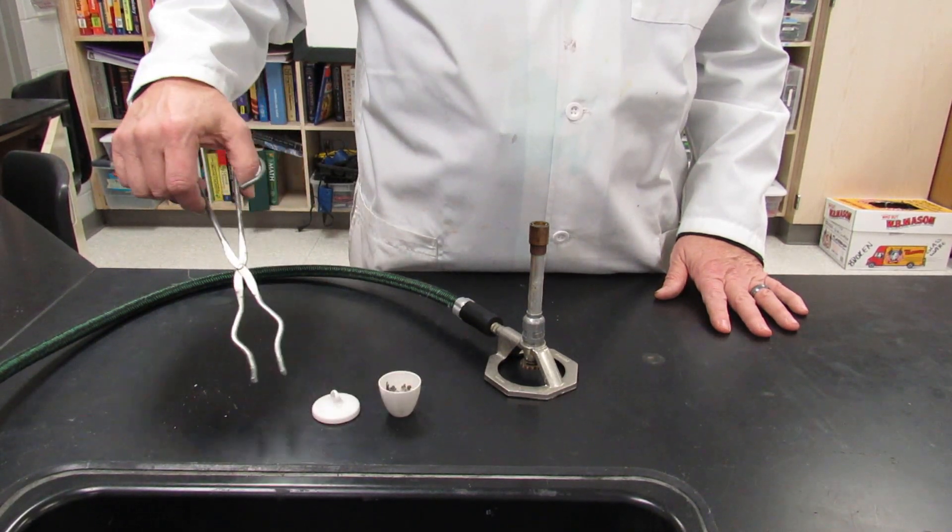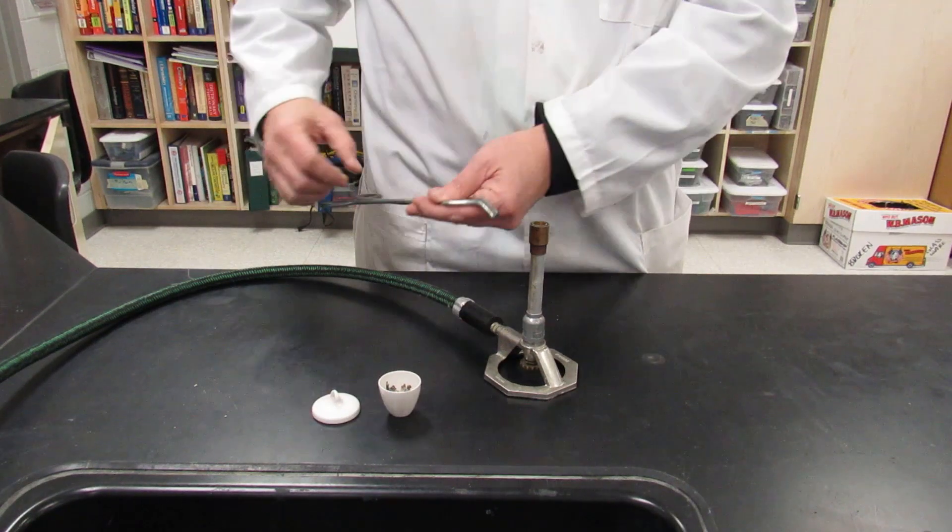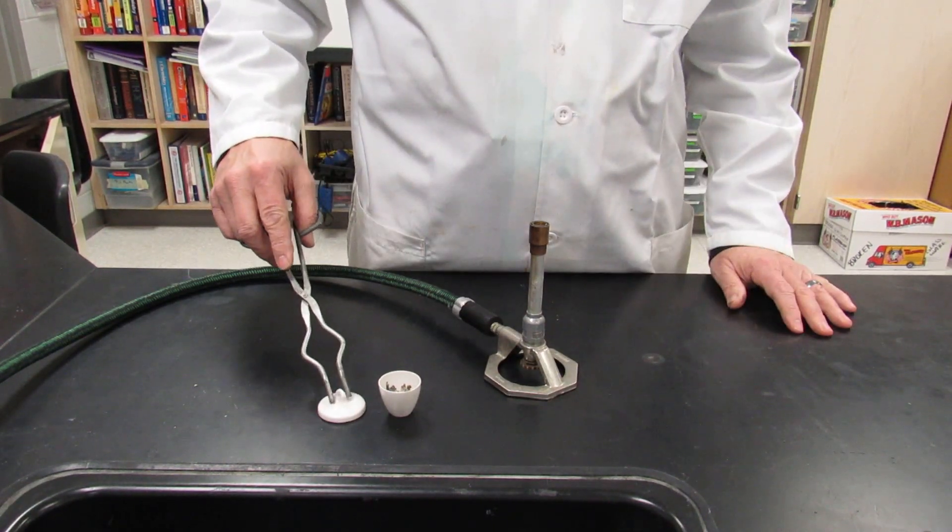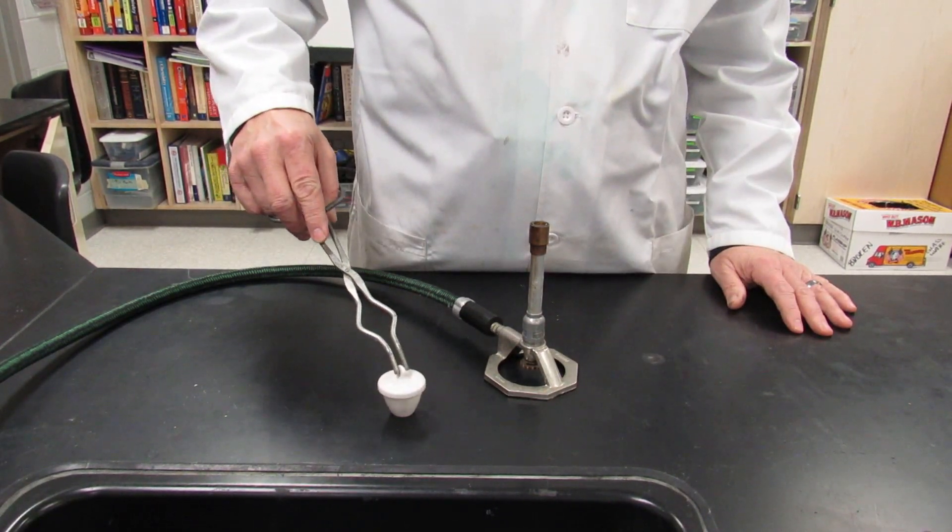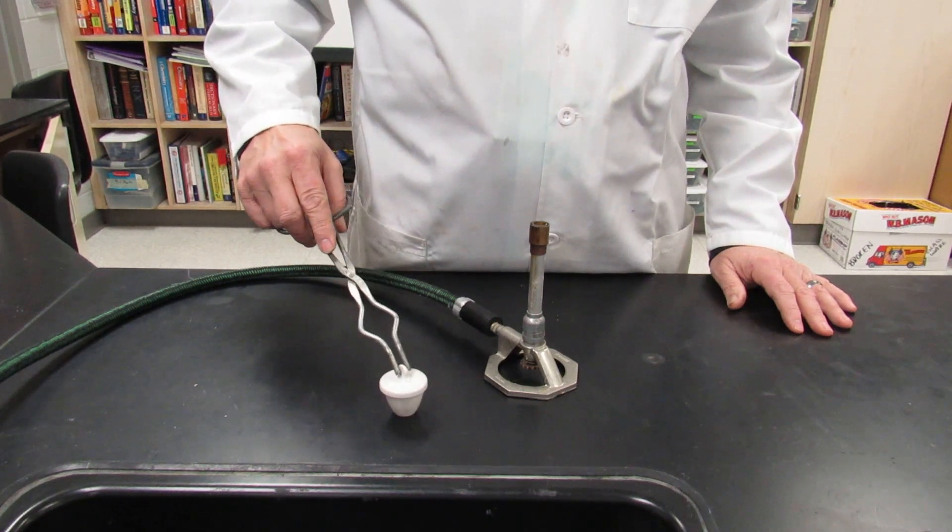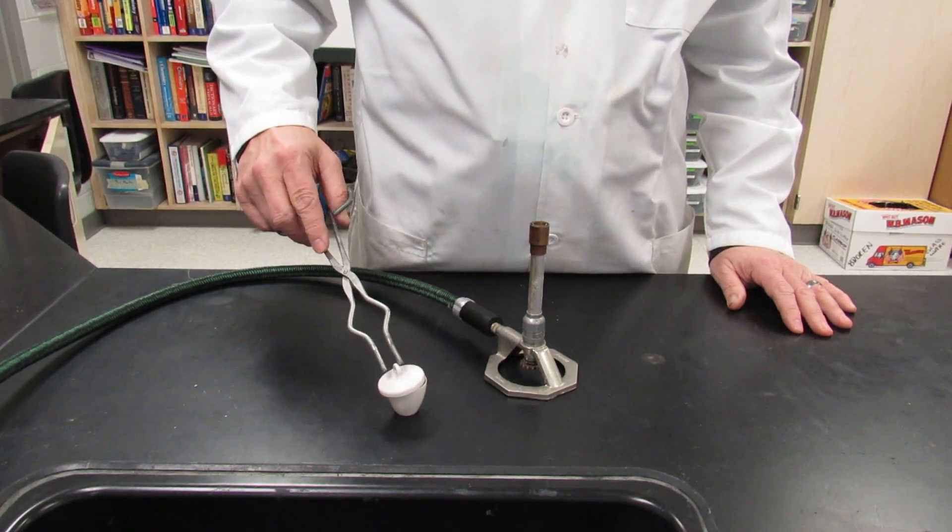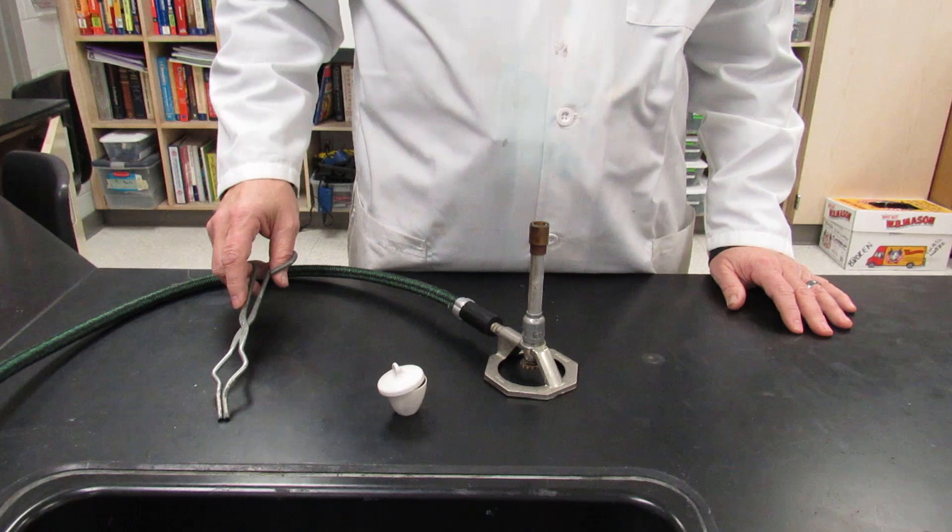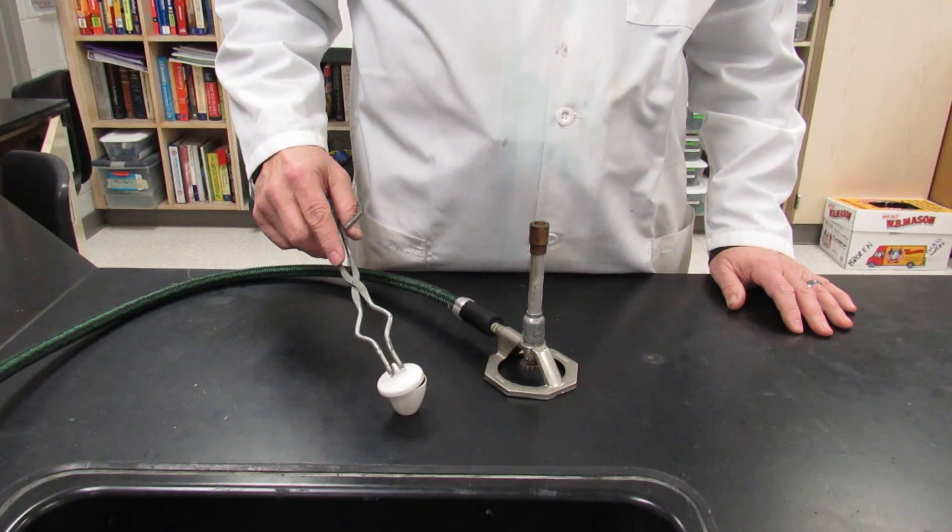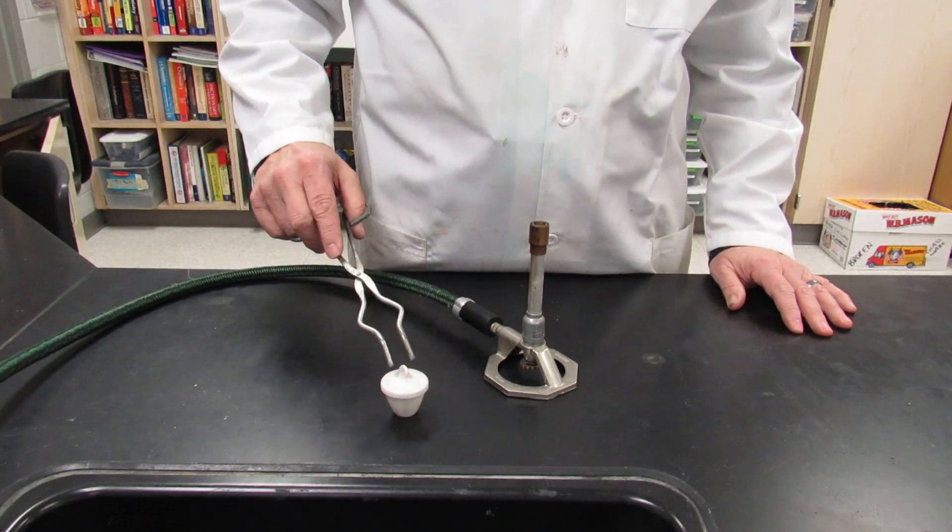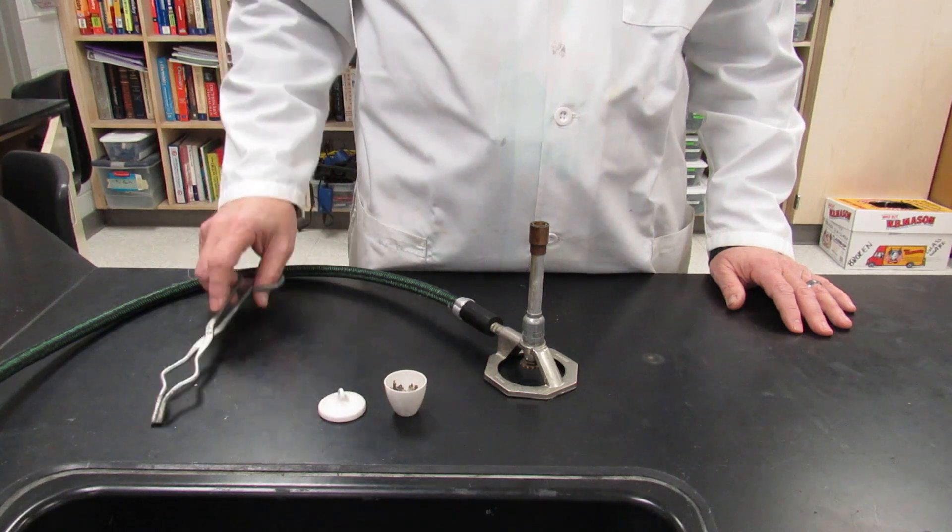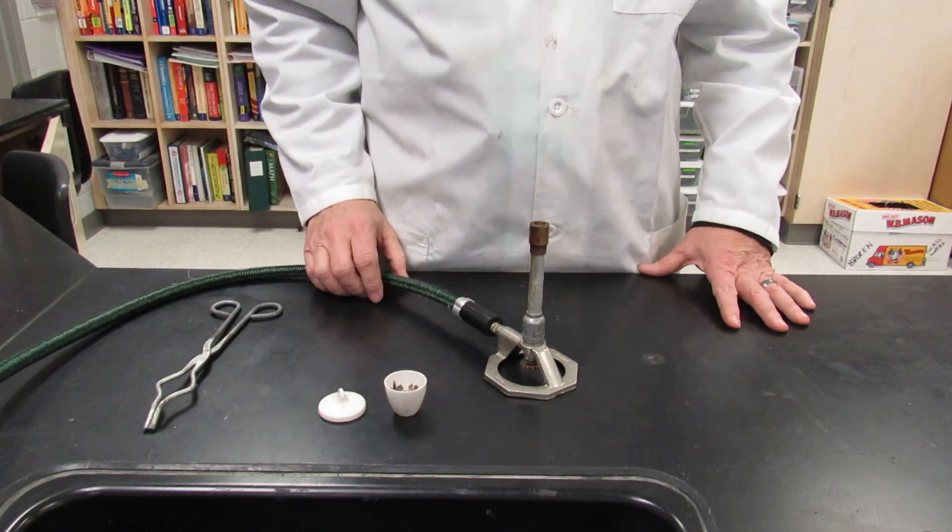You don't want the first time you're doing this to be when you're at 1800 degrees over top of a Bunsen burner. So, take it off, put it on. Practice this quite a few times. You'll also need to tilt the crucible lid to allow a little bit of air in. Do that over and over again until you feel very comfortable manipulating the lid.